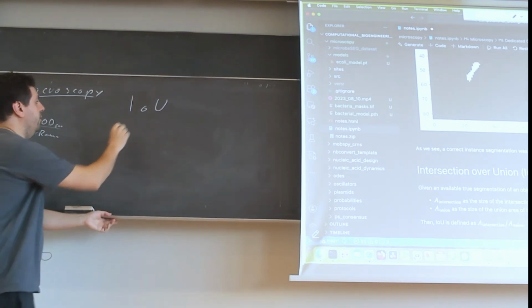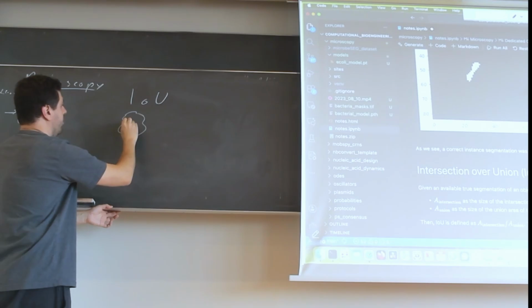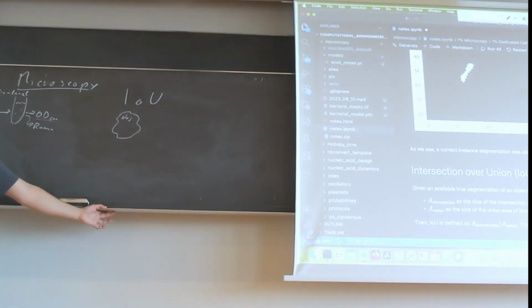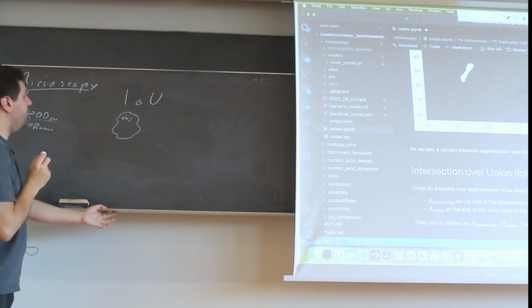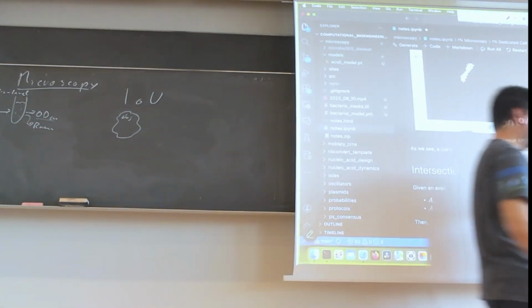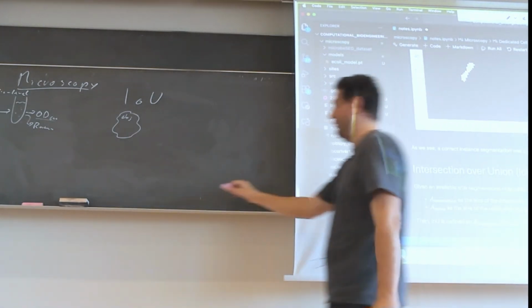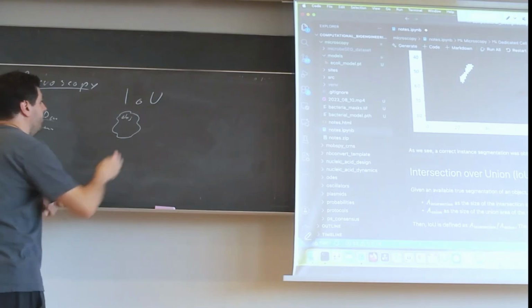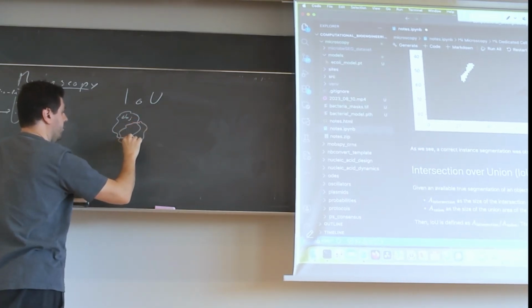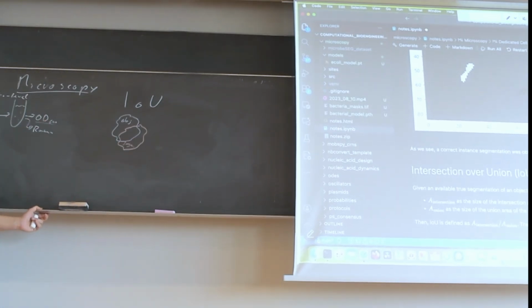And the idea is in principle here. You have here an object. This is our real object. This could be the real E. coli. And you have a segmentation. Take another color. This is our segmentation here. So it's good, but it's a bit off.